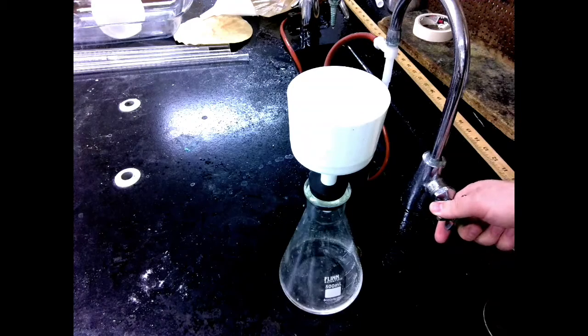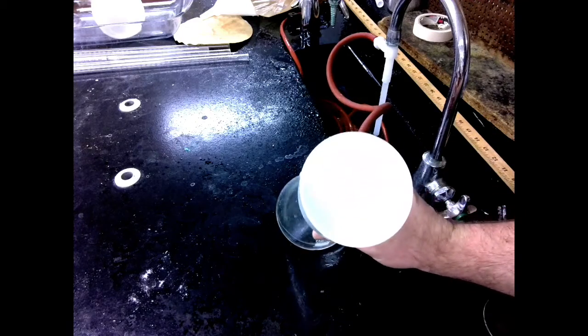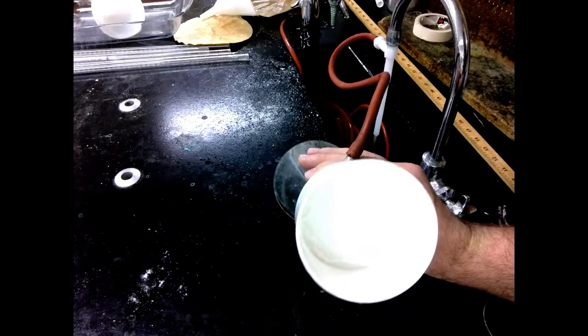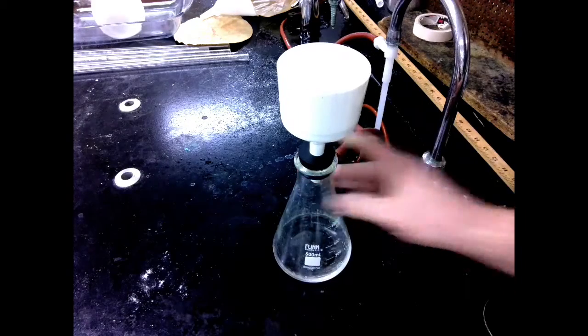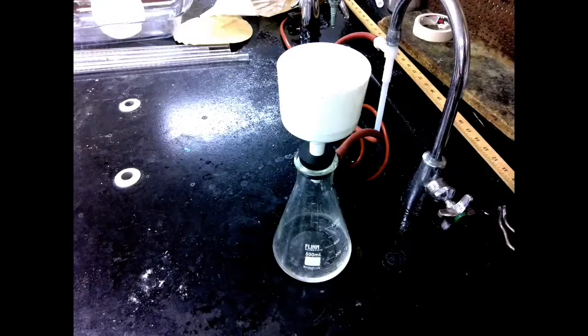I have almost all of my water pulled through, so you may not be able to see this, but I have a pretty decent layer of aspirin sitting here. However, I want this to dry a little bit, so I'm going to let it continue pulling a vacuum just to dry that out a little bit before I do anything else. All of my water has been pulled through. This is as dry as I'm going to get it.